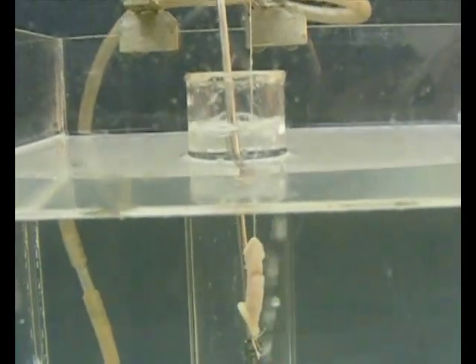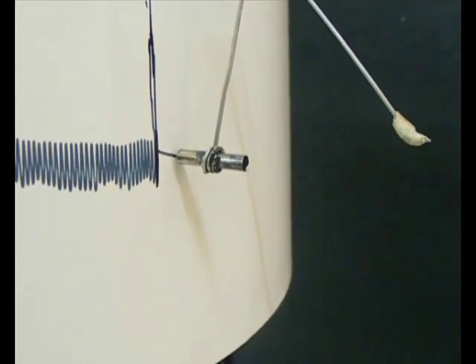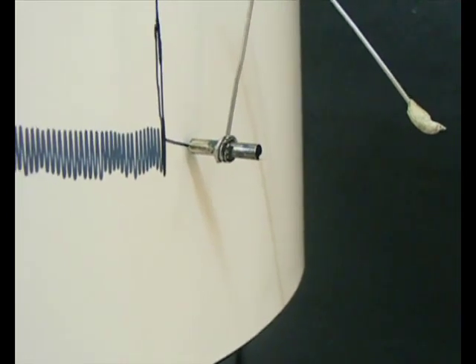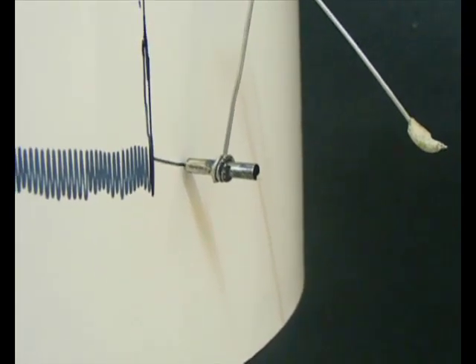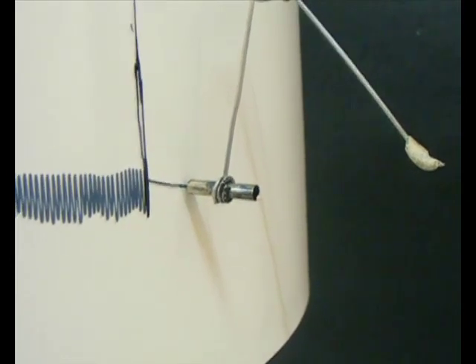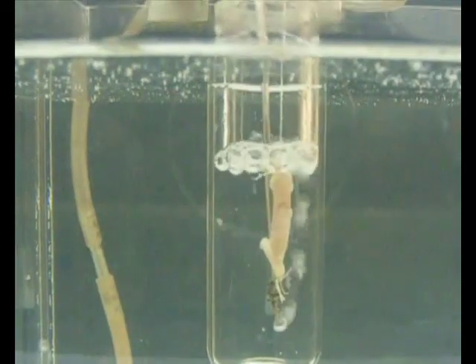Observe the change in normal response. The organ bath is then drained of water.